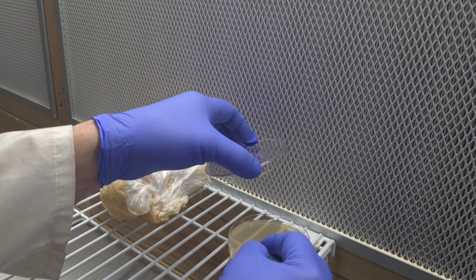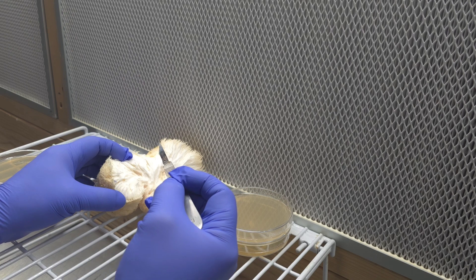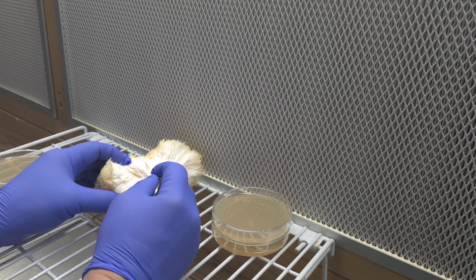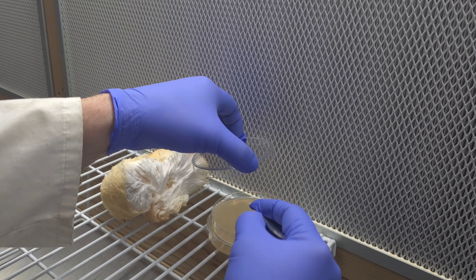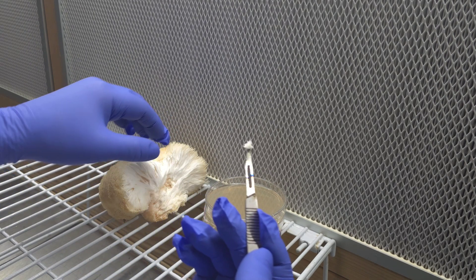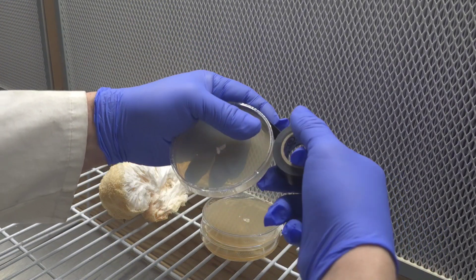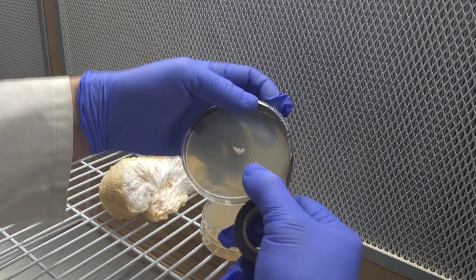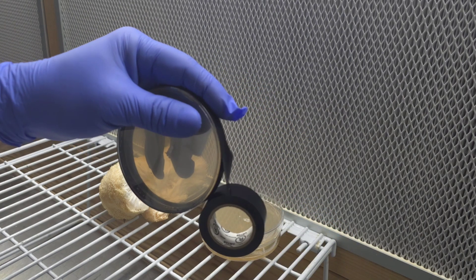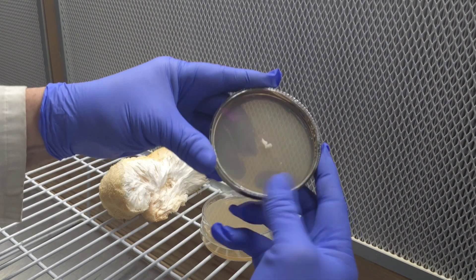I've just taken that first tissue sample from the inside and I'm pushing it into the agar — you kind of learn a technique after a while. I try to tuck the tissue in there to get it to stick. Now I'm taking multiple samples, which is always wise, especially for a wild mushroom, just in case you get significant contamination on one. That way you're more likely to get a successful clone. After all clones are taken, seal your petri dish — I like to use electrical tape, though parafilm works too. There we go, plate all sealed up.